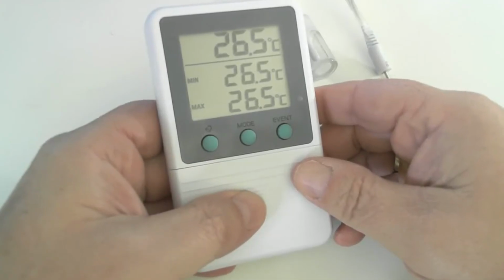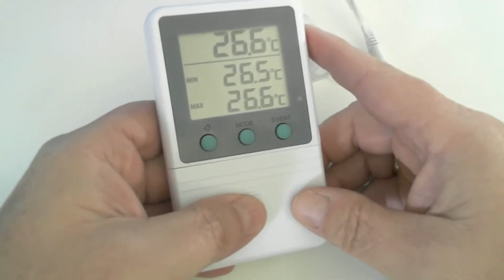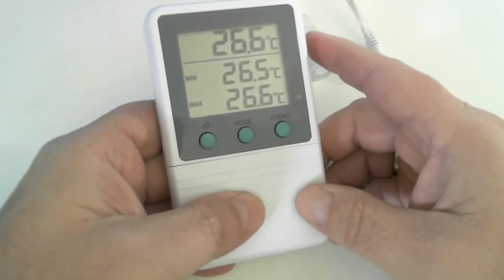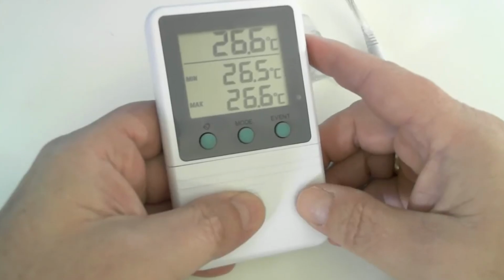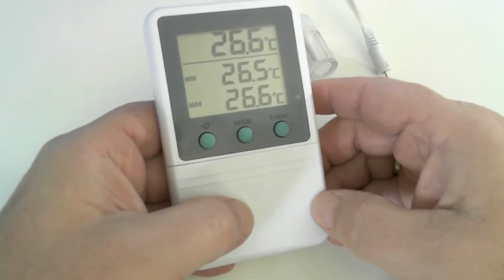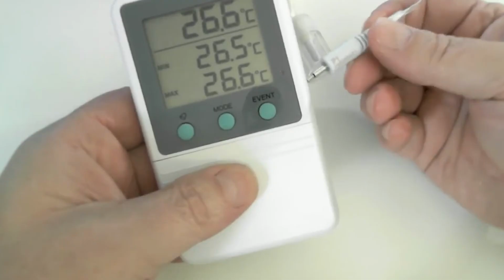Okay, in setting up the ACC821, it has to be noted that the unit has the ability to measure ambient temperatures with its internal sensor, or use external probes to monitor temperatures in refrigerators, freezers, or other devices. If your application is to use an external probe, then the probe must be plugged in while the alarm settings are being made. In this demonstration, I'll be setting the unit up as though we were measuring vaccines in a refrigerator. Alright, so let's plug in our external bottle probe.